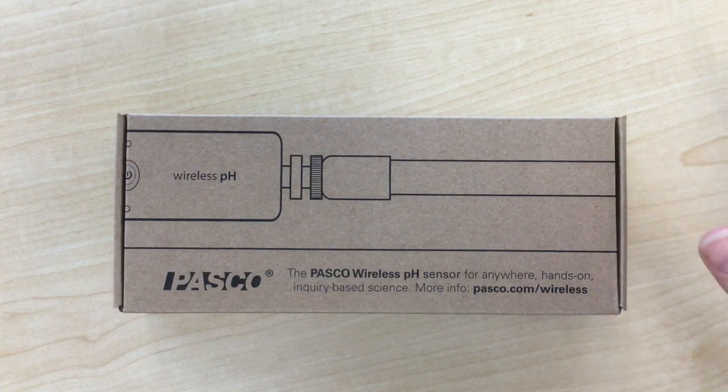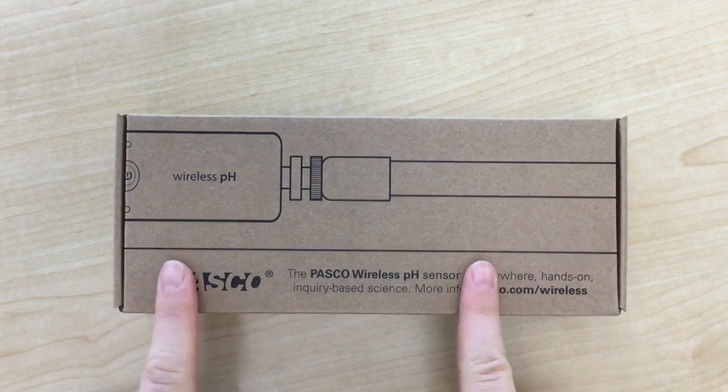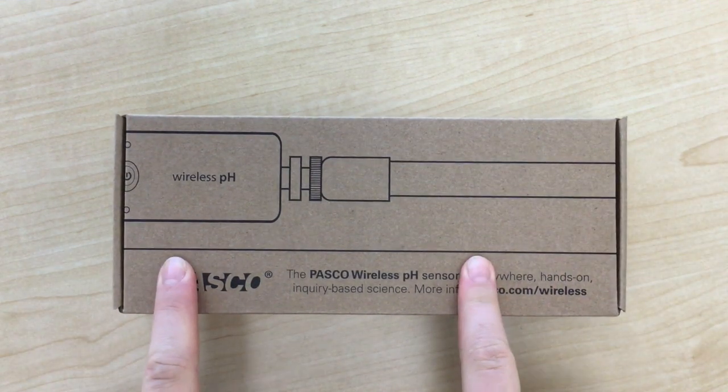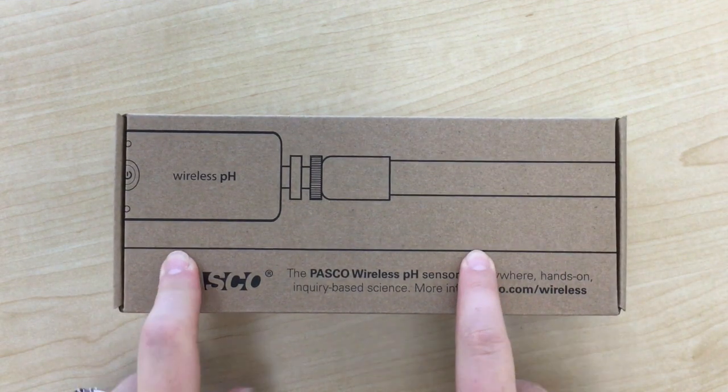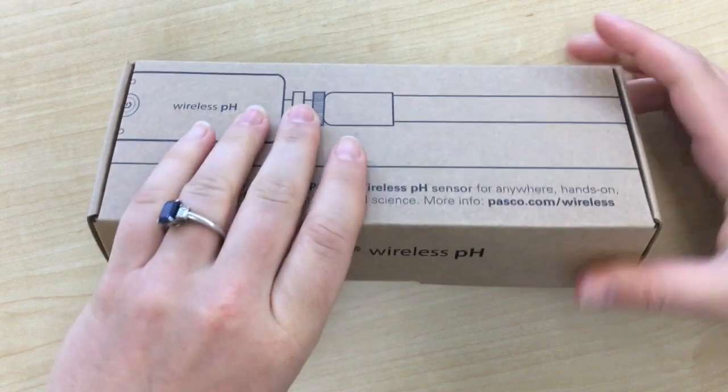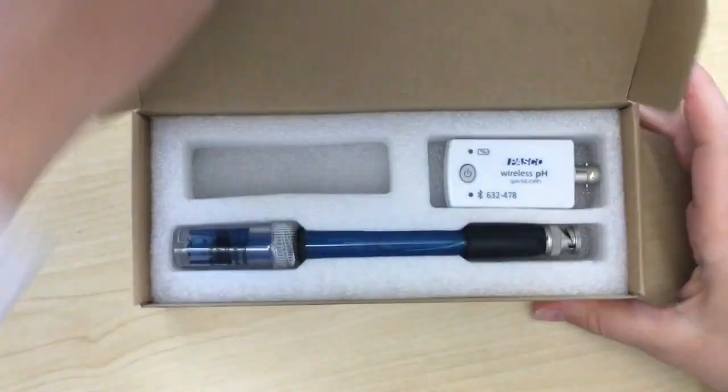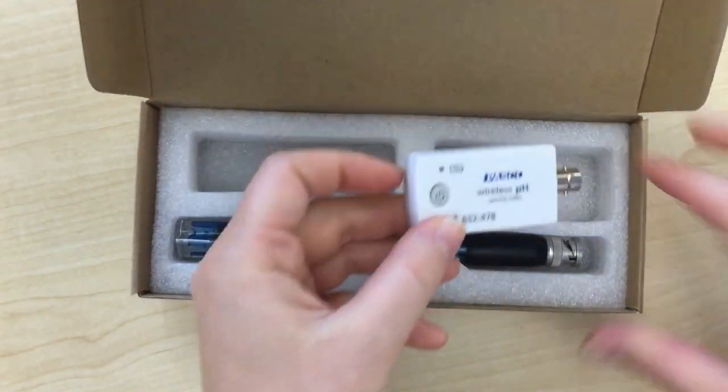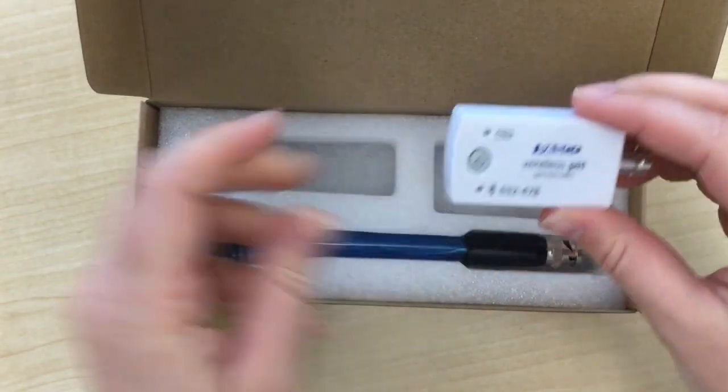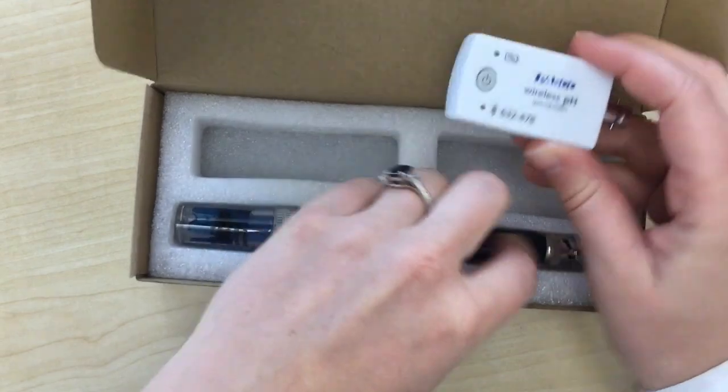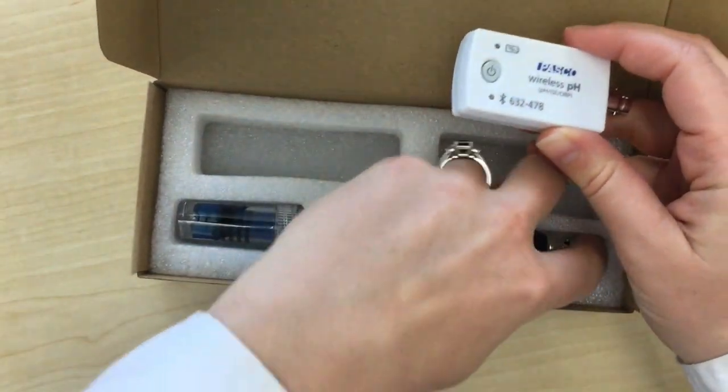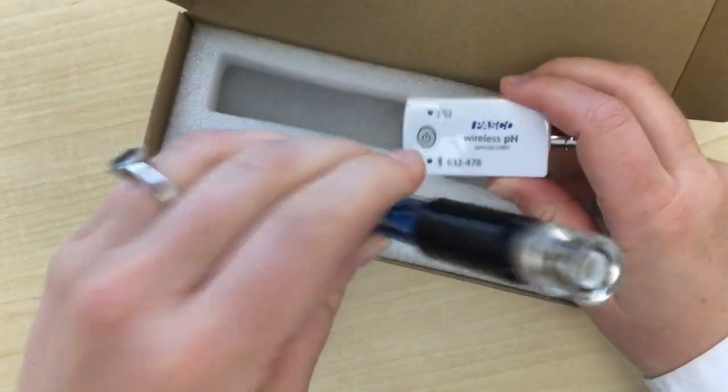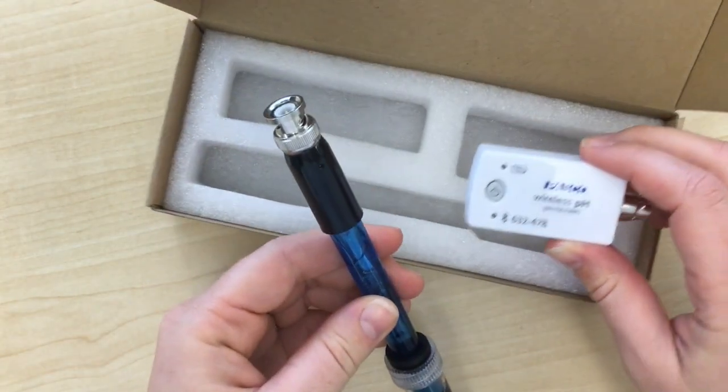After you've downloaded the software, you are ready to start using your wireless pH probe. In the box you'll find the wireless sensor and you'll find the pH probe.